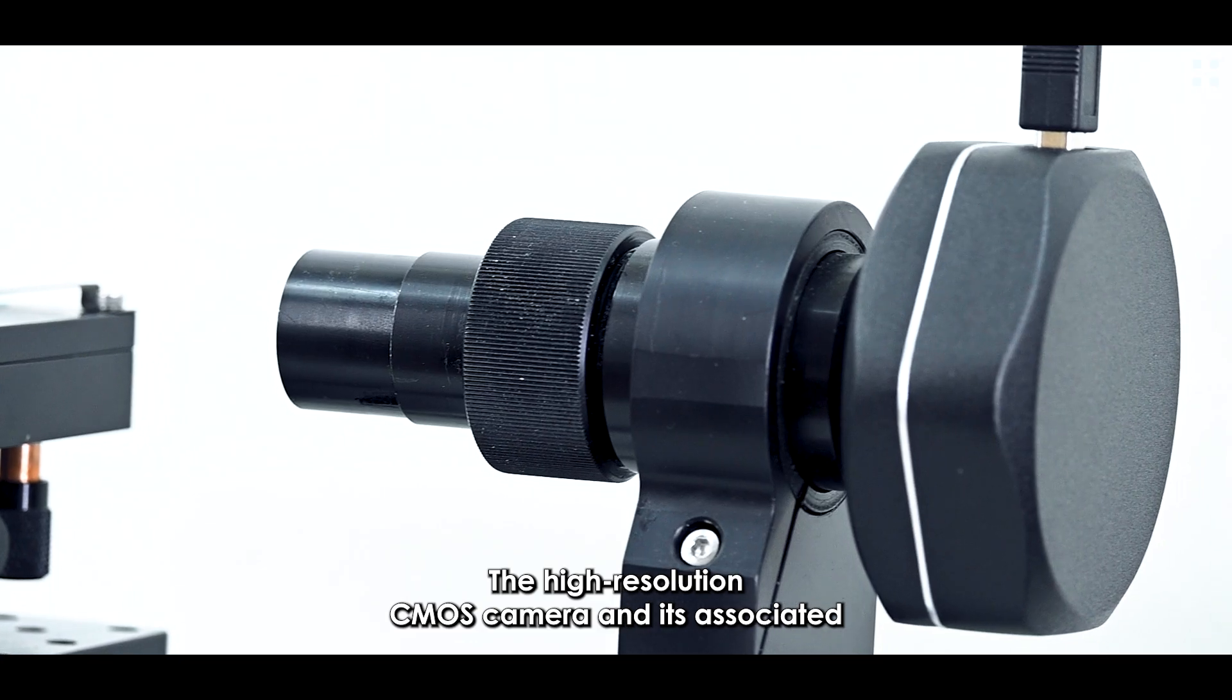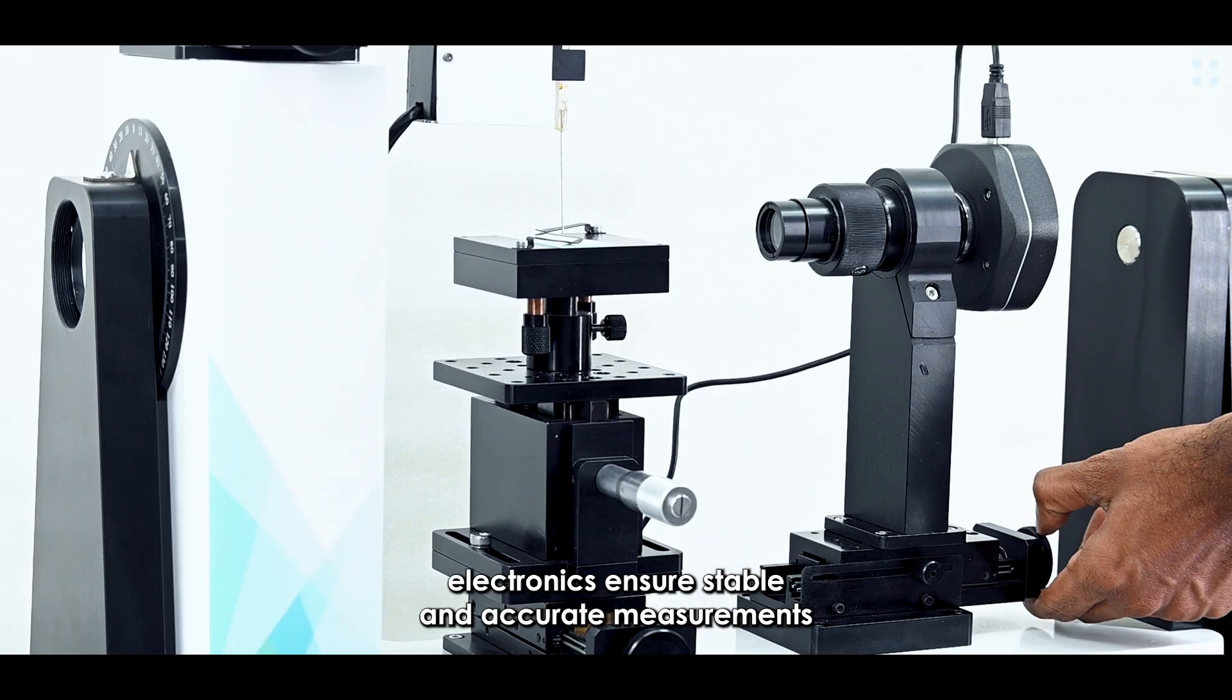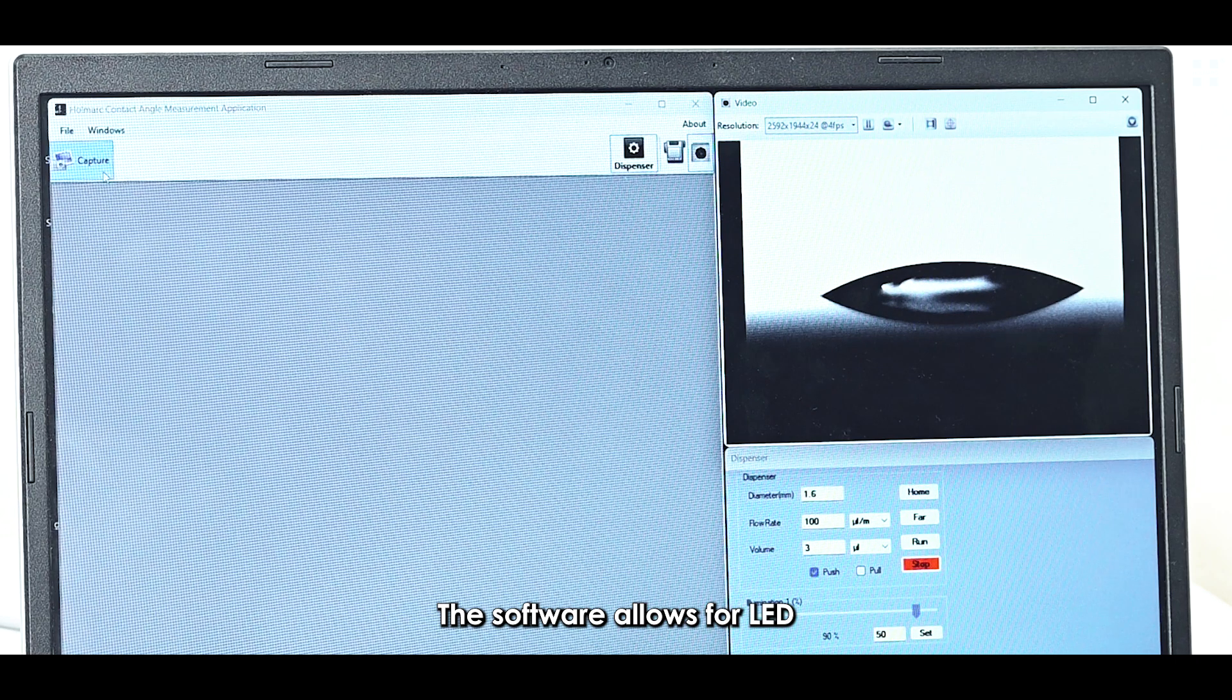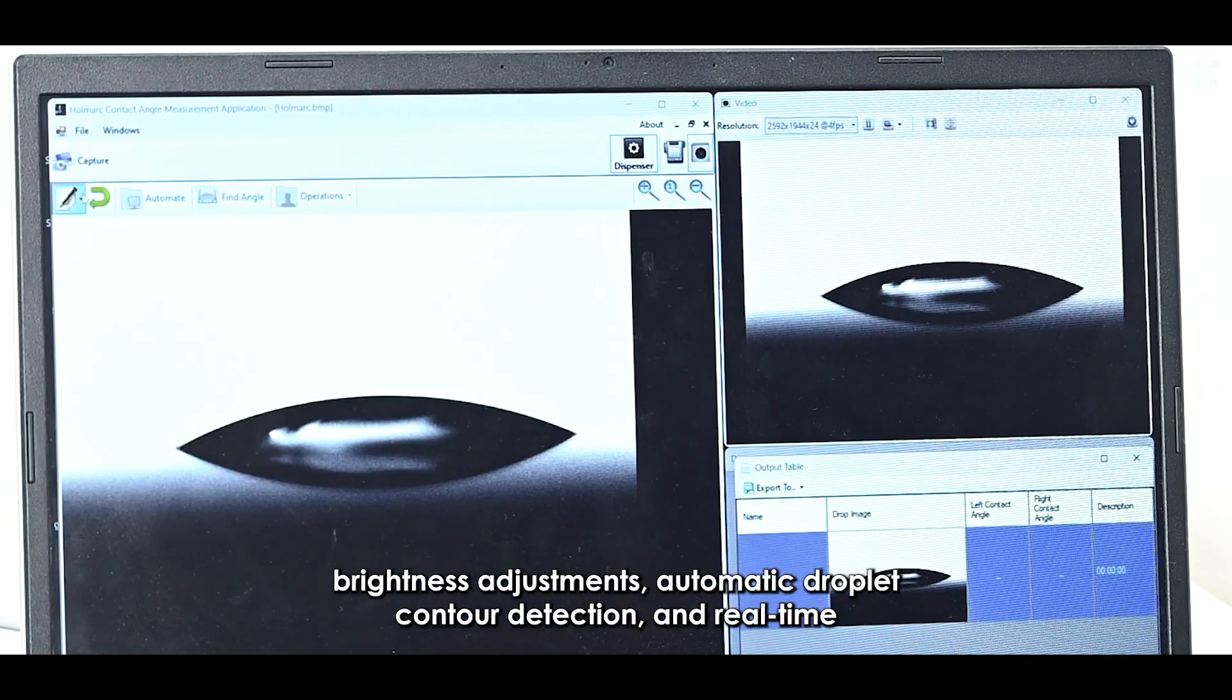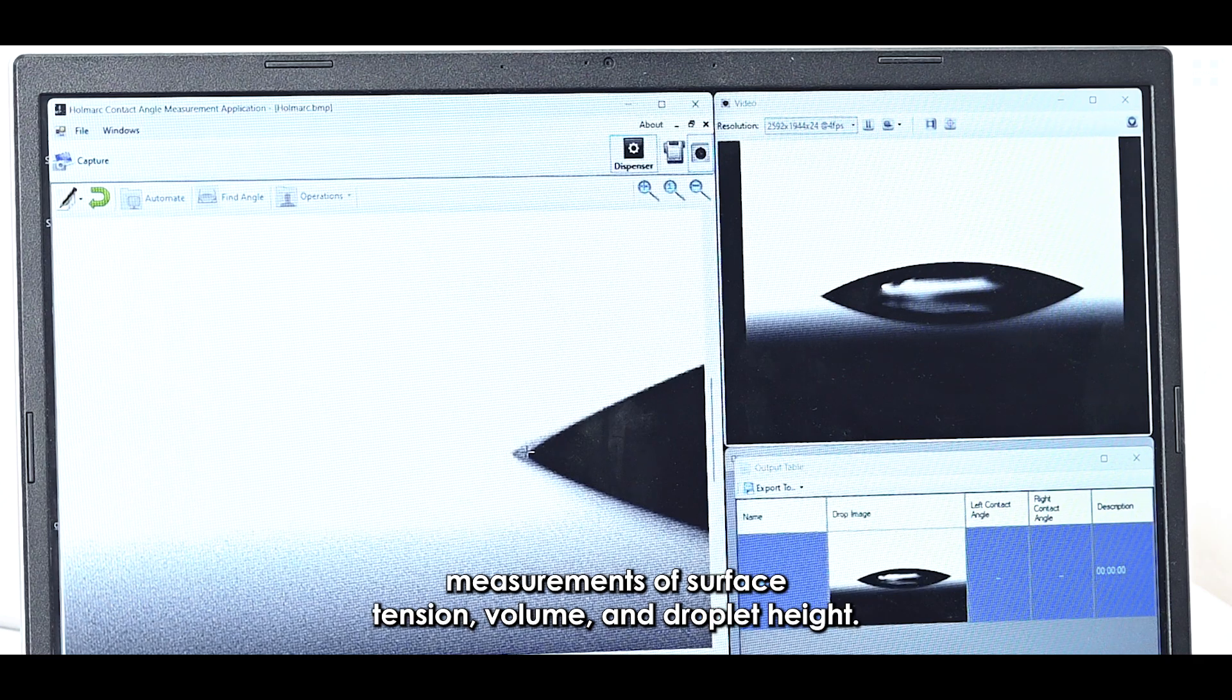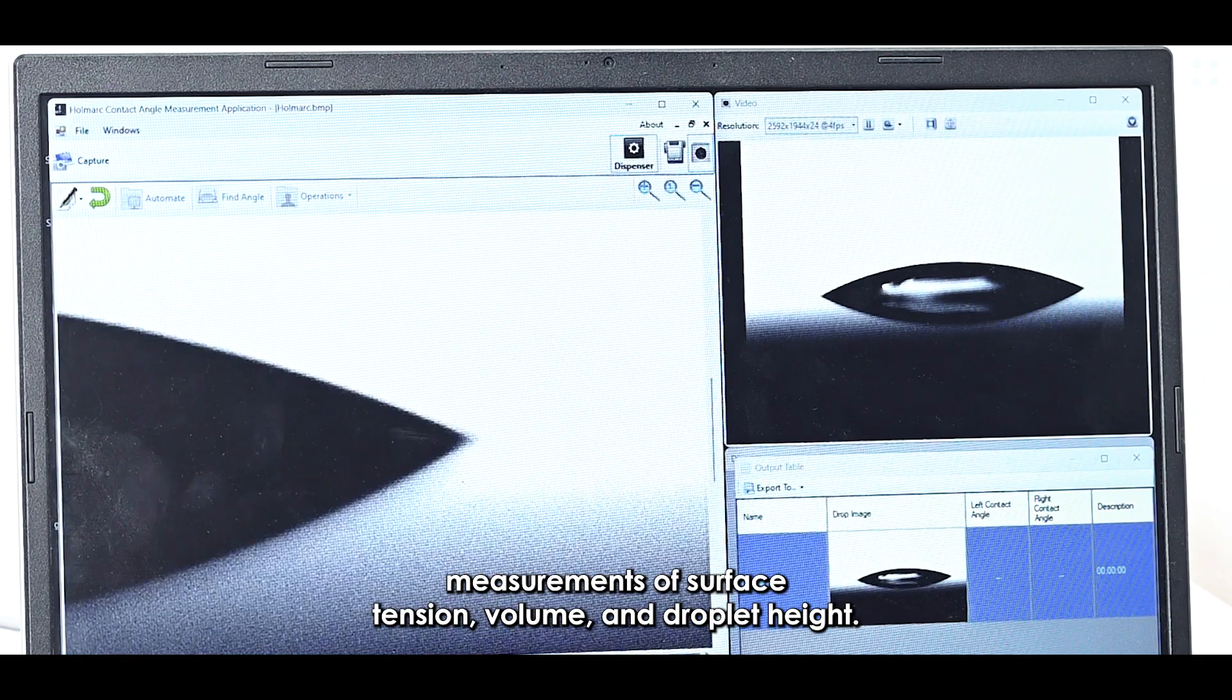The high-resolution CMOS camera and its associated electronics ensure stable and accurate measurements. The software allows for LED brightness adjustments, automatic droplet contour detection, and real-time measurements of surface tension, volume, and droplet height.